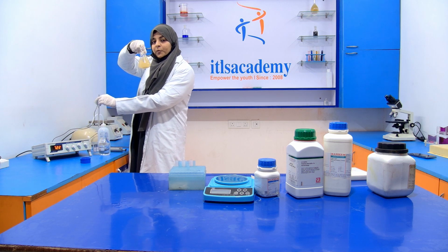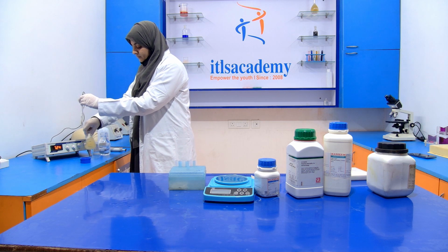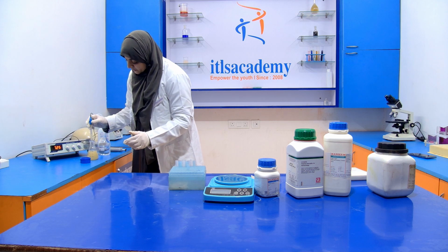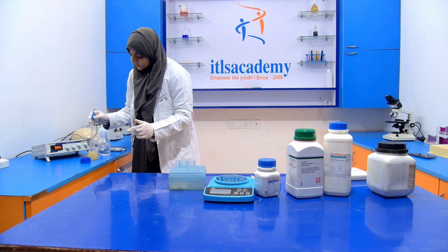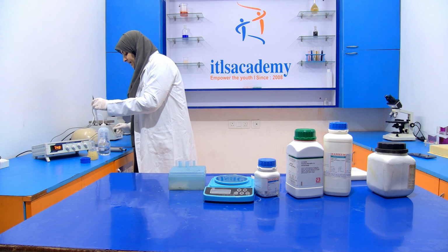Again, with proper mixing, we have to mix the NaOH into it. Again, we are adding it. It reaches 7.4. That means that our pH is maintained.